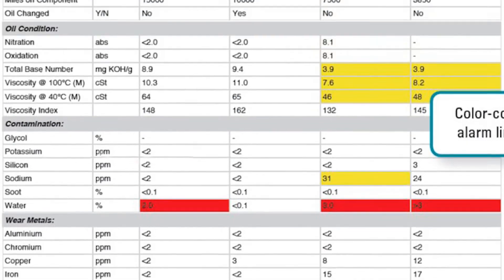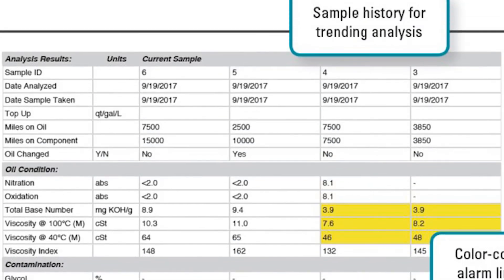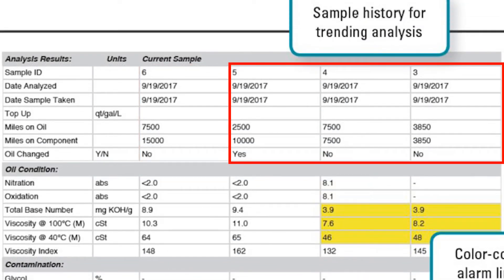The Microlab report shows the results for the current sample and up to three of the most recent historic samples for the same component for trending analysis.